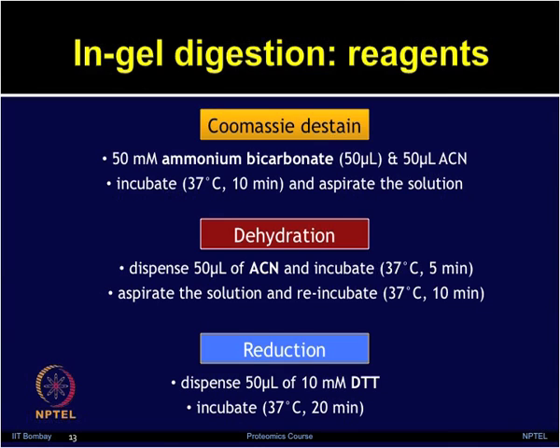Now, why is the reduction step required? After the stain removal, the next steps include reduction as well as alkylation of protein residues, so that you can denature the protein into its primary structure.